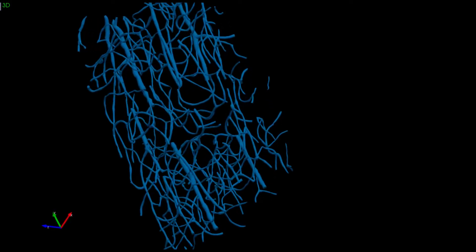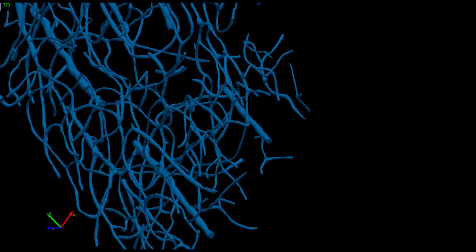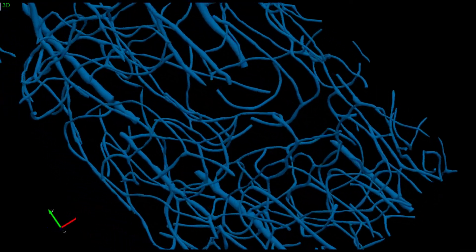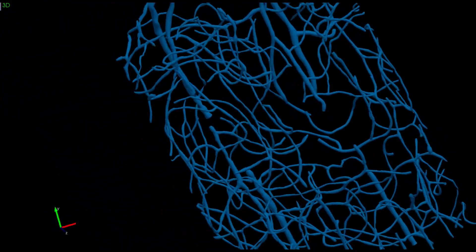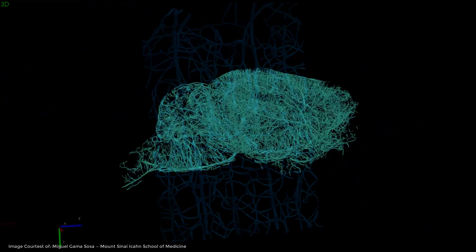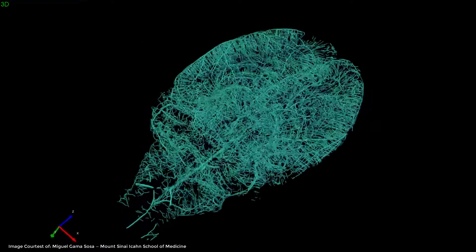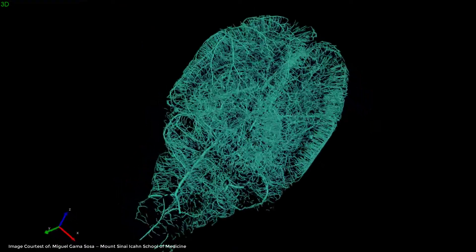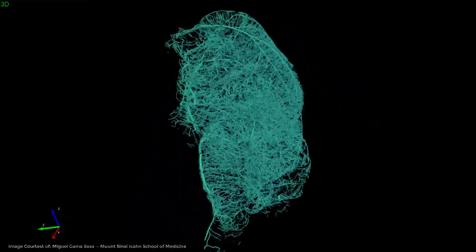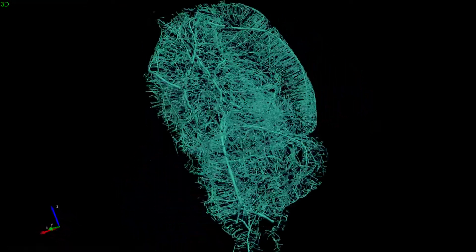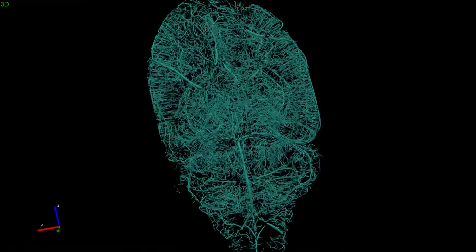Whether you are reconstructing smaller, less complex microvascular images, or reconstructing an entire brain, Veselucida 360 is the perfect software for reconstructing vasculature from already acquired image data. Let's see how it works.